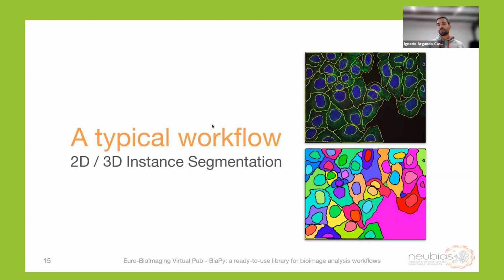Okay, so that was the first part of the talk. About the second one, because as I said, this is something that I guess we all face when we work with microscopy images, I thought it could be interesting to go into more detail for a typical workflow, such as the 2D or 3D instance segmentation.